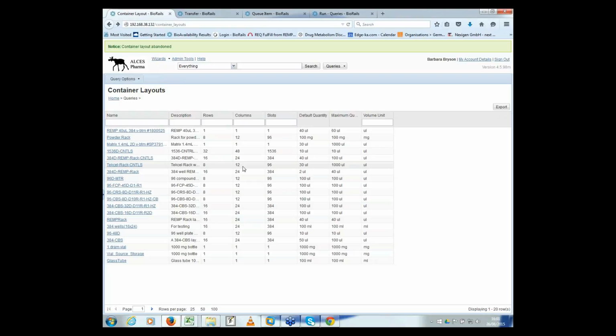But when I set up the service which allows me to request, you put in it the parameters that you want to vary. And then as you make the request, you can specify the exact volume and concentration of every sample in the order if you want to do that. It gives you a form to fill out that you can just fill out yourself. You can also map that form to a spreadsheet environment so you can fill it out there too, or you can automate it if there are rules to it as well.